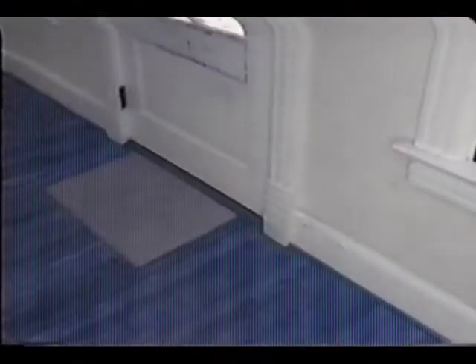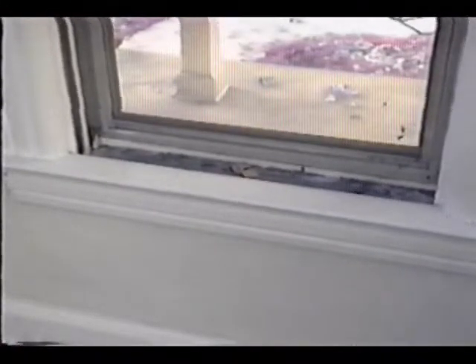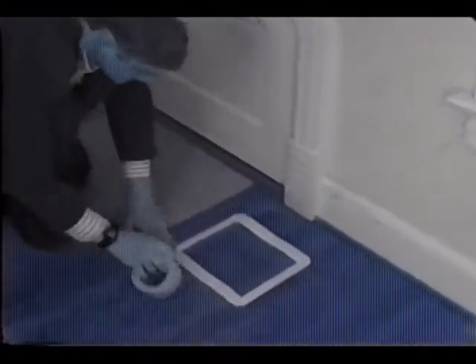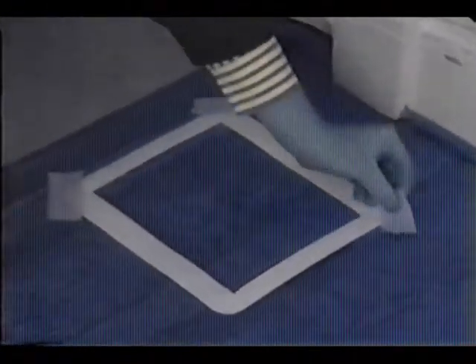The first step in the dust wipe sampling procedure is to identify the exact area to be wiped. On floors, the area is usually a play area, or just inside the main entryway to the room or under a window. For windows, the area is on either the interior sill or trough of the most commonly opened window. Do not walk on or touch this area. Fasten either the template or the masking tape to the perimeter of the area in a rectangle or square about 1 square foot in area.